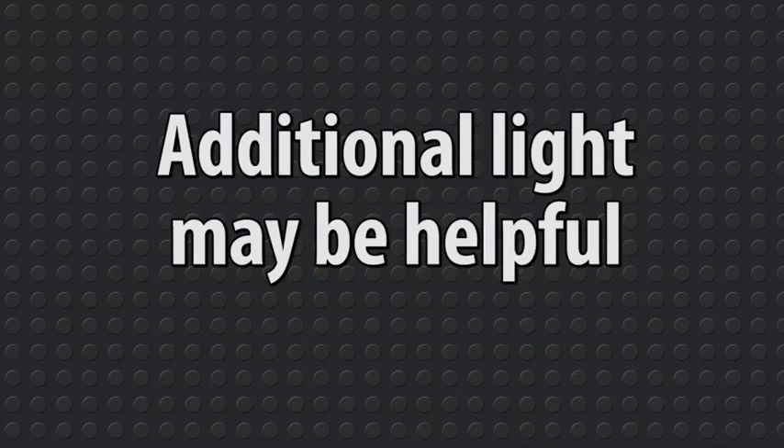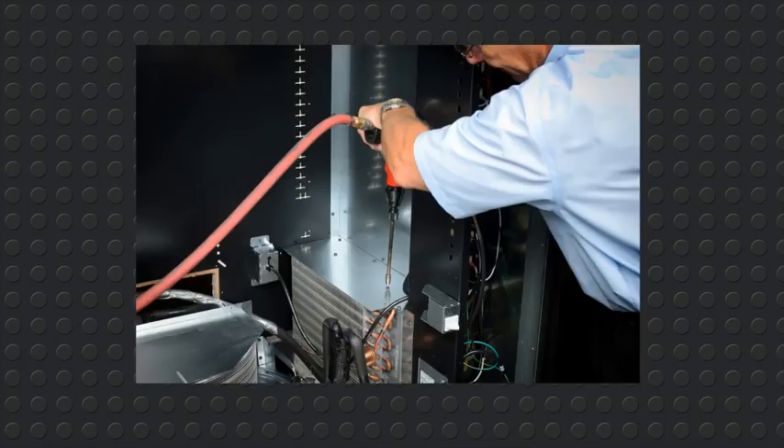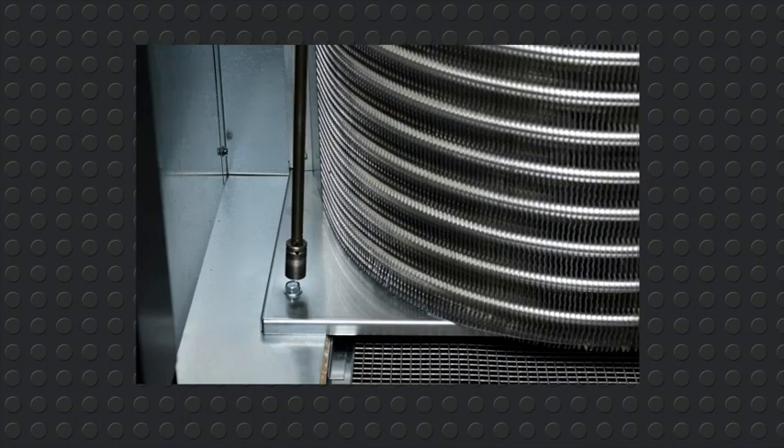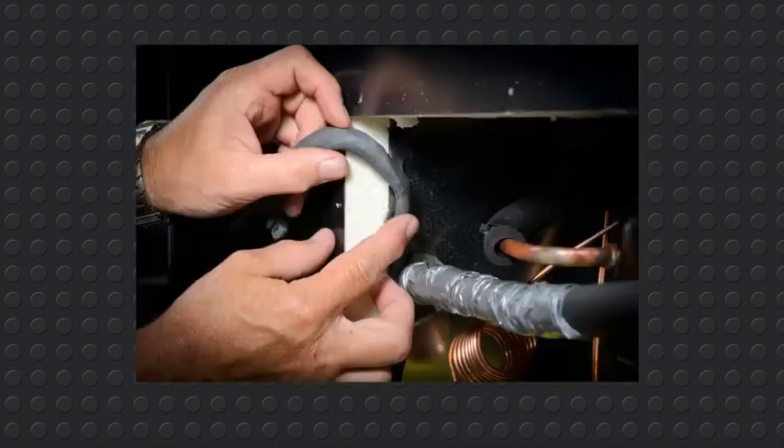For the back two screws, additional light may be helpful in locating the holes. Now reattach the IEC cover box starting with the bottom screw. Install the eight screws in the evaporator cover plate. Install the four three-eighth inch bolts in the chiller. Install the chiller housing using the chiller housing's three-eighth inch bolts. Check the seal around the housing and be sure you've installed permagum.